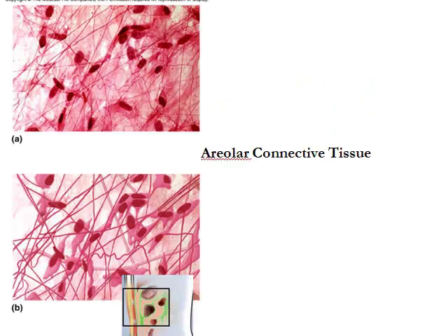The first type of connective tissue we're going to look at is areolar connective tissue. This falls under the class of loose connective tissue. It is a fairly loose arrangement of cells, fibers, and ground substance. What you see here are a lot of individual cells called fibroblasts — not so densely packed together like you would see with epithelium.